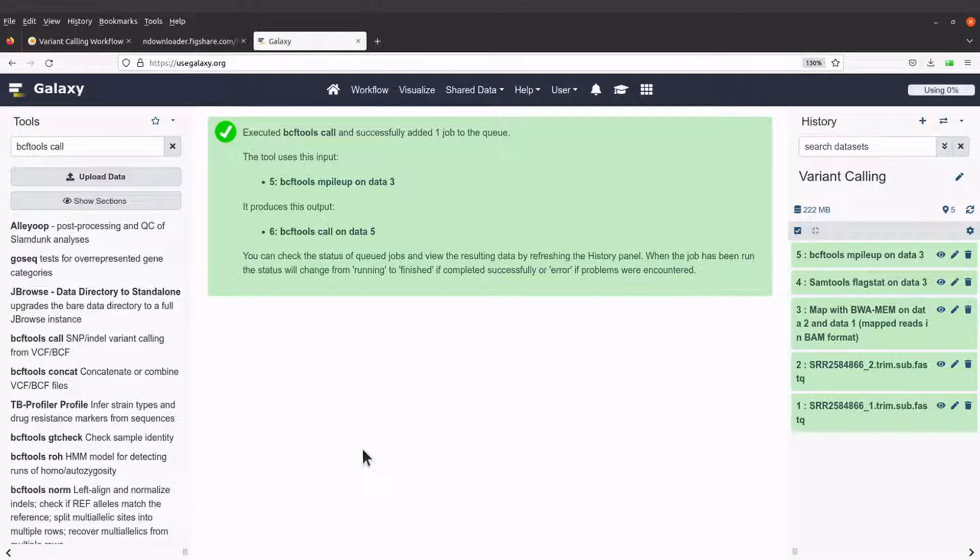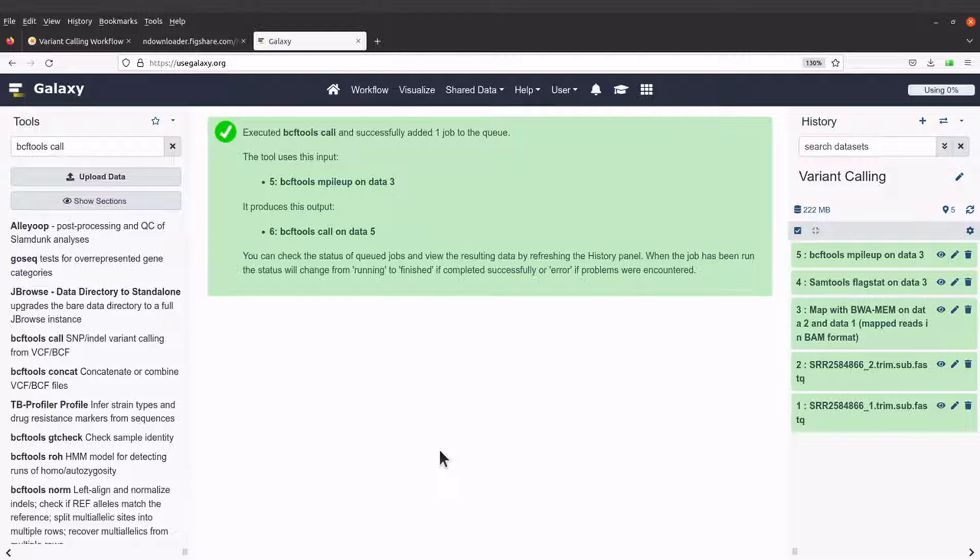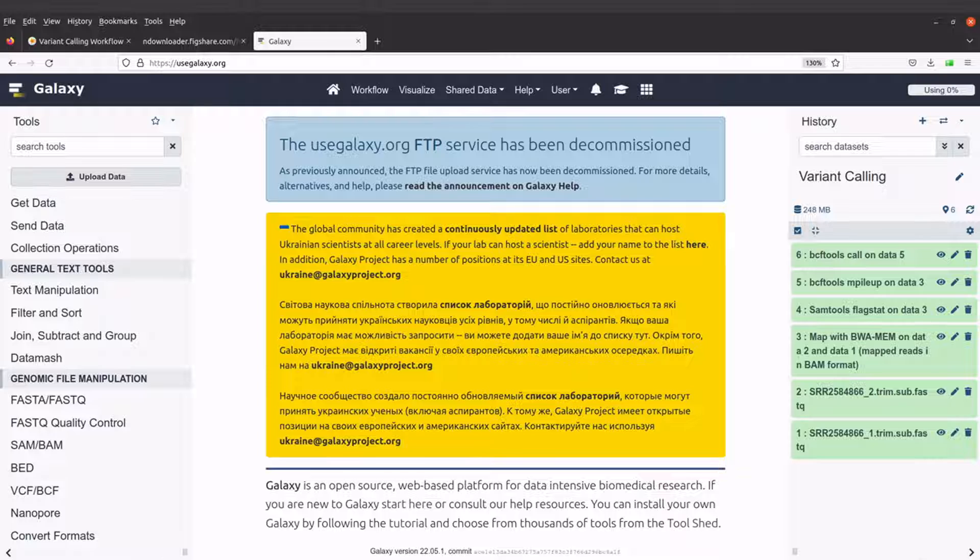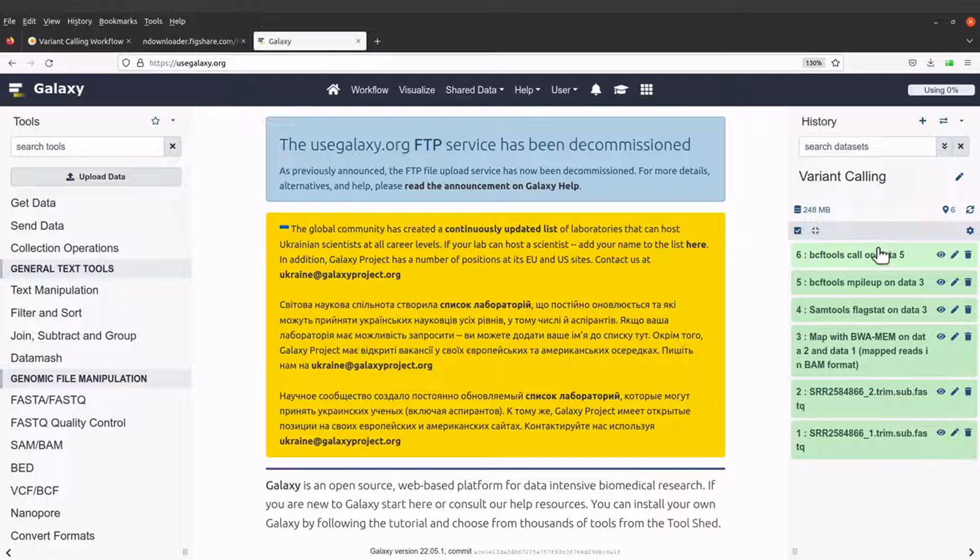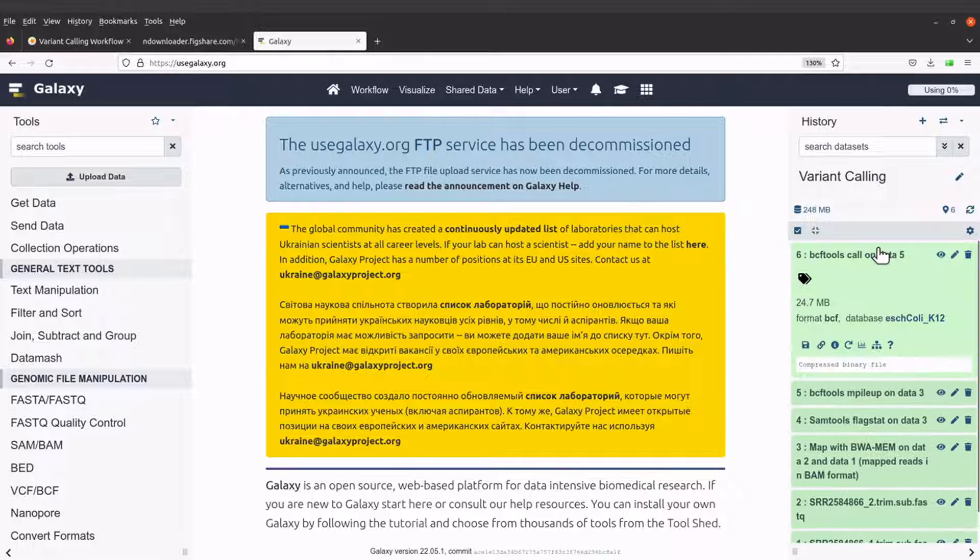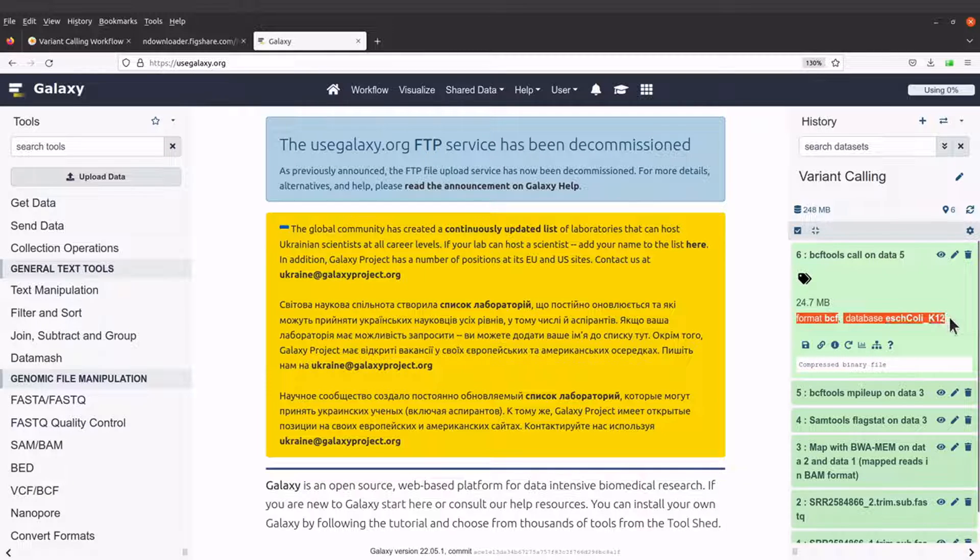Okay, so bcftools call command has been initiated. So let's wait for it to complete its work. Okay, the bcftools call command has been completed and that is why we have this output here. You can click it and you will see this text here.